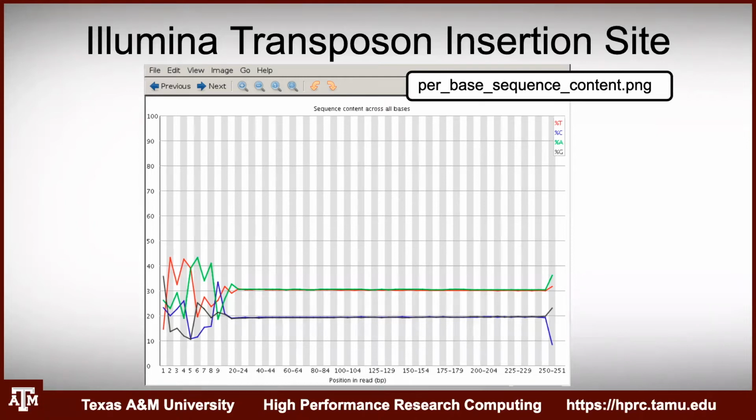They are actually part of the genome, so that is real, good quality reads, but you get this because of the way the library was created. So it's not something you want to trim off. Also, I think just to note, trimming can have really major effects on mapping rates. We'll talk a little bit more about that coming up.